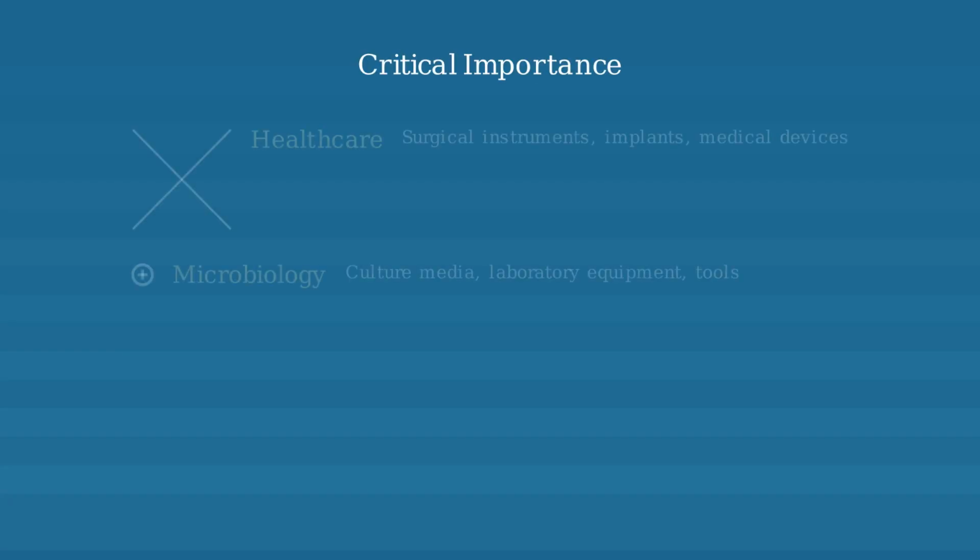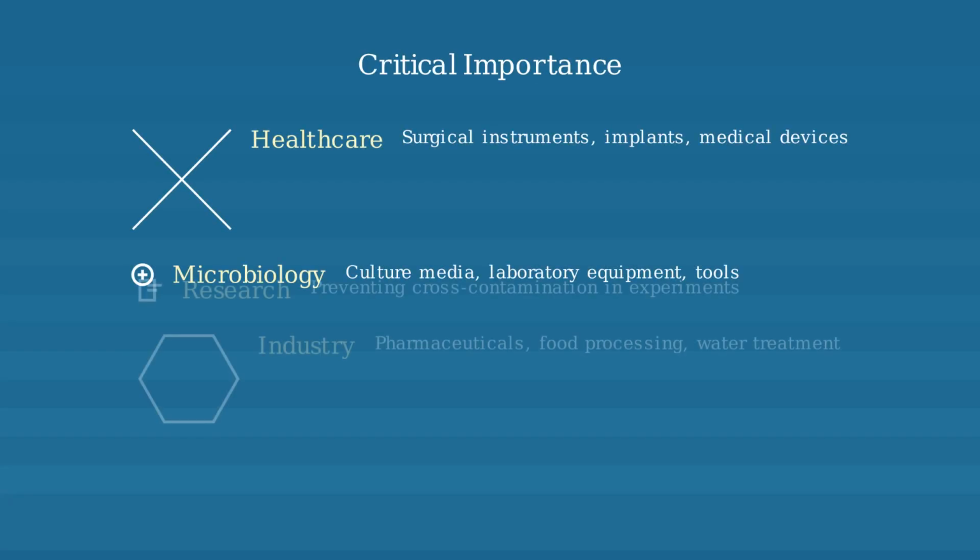Sterilization is critically important across multiple fields. In healthcare, it ensures surgical instruments and medical devices are safe for use. In microbiology laboratories, it prevents contamination of cultures. In research, it ensures experimental integrity, while in industry, it's vital for pharmaceuticals and food safety.